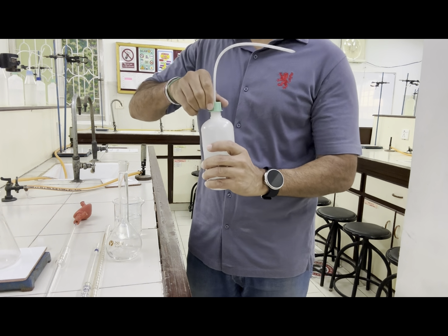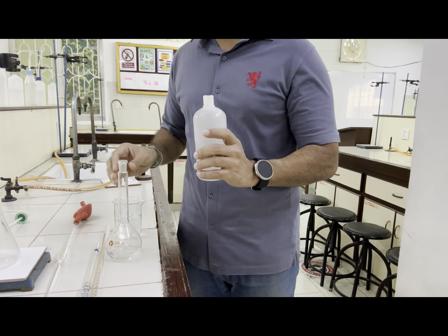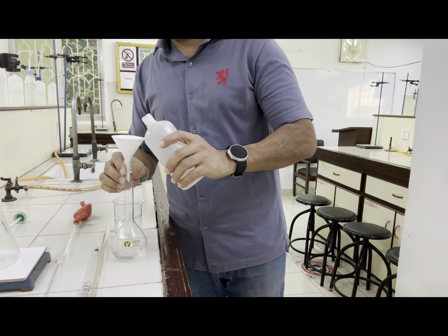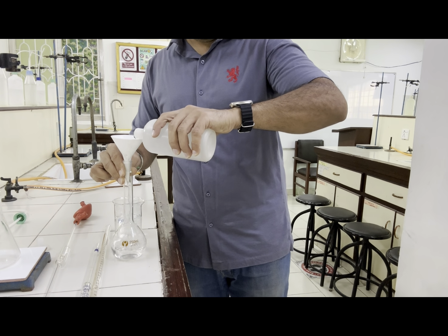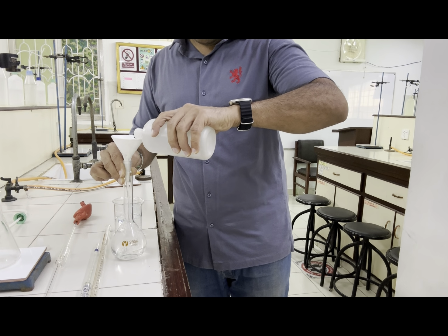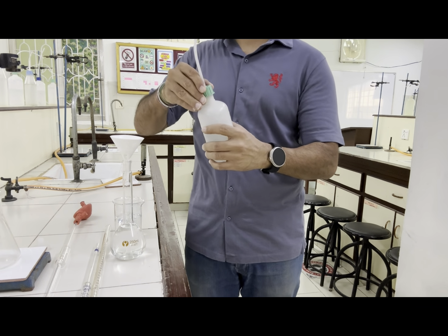So we need a larger volume. That is why I will remove the cap and I will add quite fast first. And when I reach close to the mark, I will attach this cap and I will add dropwise. Now, I will put it back.